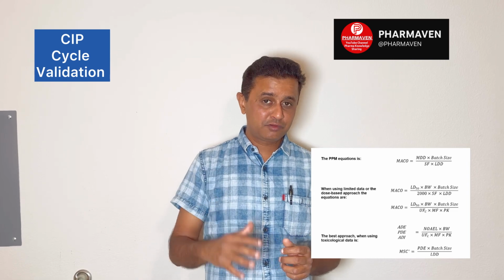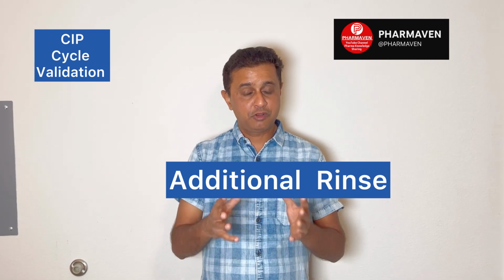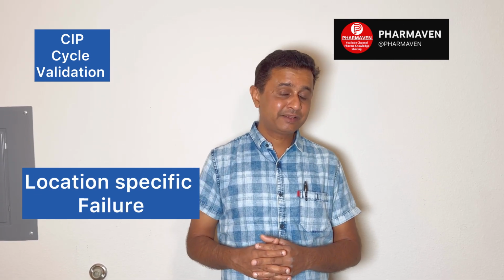The rinse and swab samples should have traces below that maximum allowable carryover. If the traces are below that, it means your cycle is good and it's cleaning the product. But if traces are more, then you have to work on the CIP cycle again. You may need additional rinse steps, or you have to determine which specific location is failing in cleaning validation and how to effectively clean that specific part. You may have to dismantle certain parts and wash them separately. There are ways and methods to overcome this.